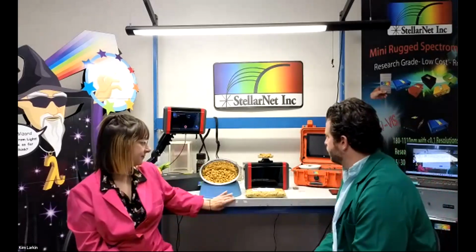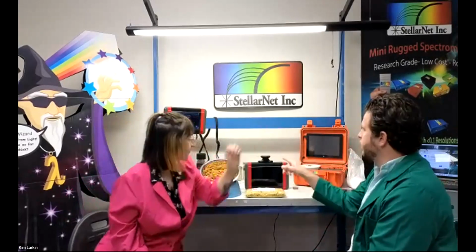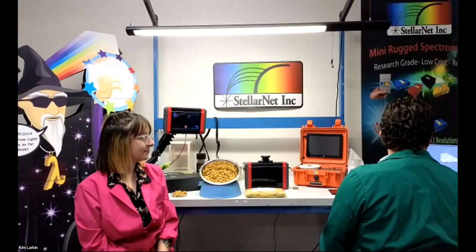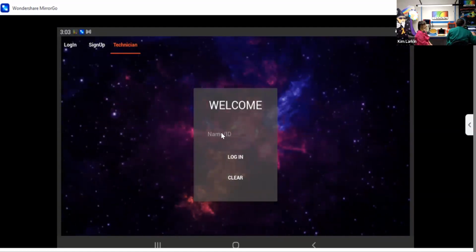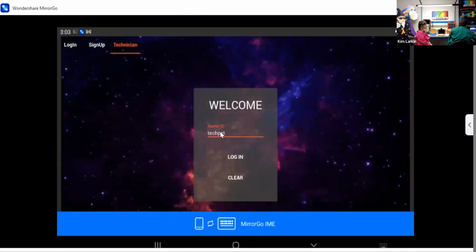Without further ado, we're going to go ahead and share the screen. And when we do the measurement, we're basically going to be putting kibble blend onto the fixture head, just as Stephanie had showed you there. So, okay, share my screen. Right now we're logging in. See at the top we have technician login, and so we now are going to call this tech pet. Okay, tech pet login.